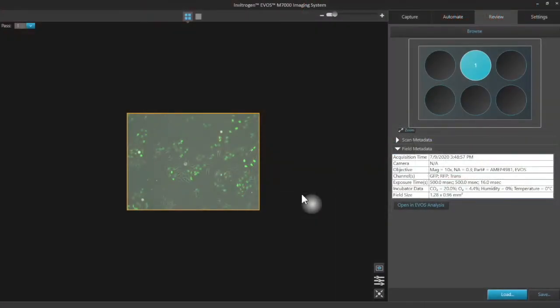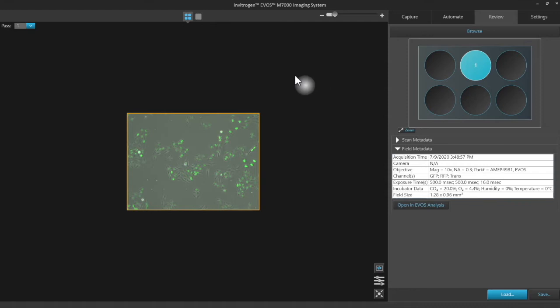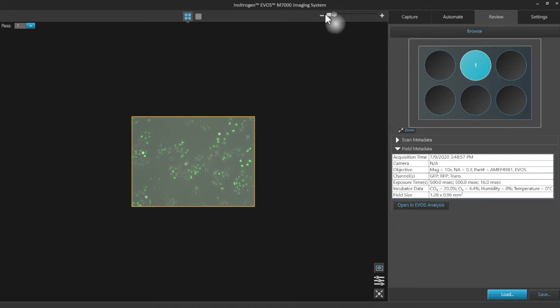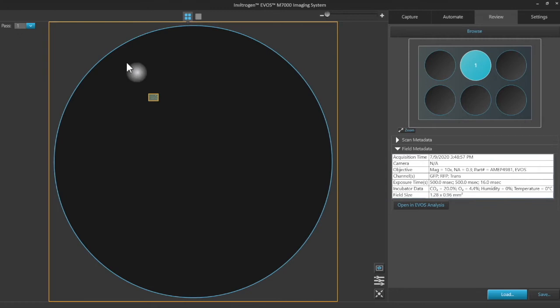We've finished scanning images of our cells in multiple channels. These data came from this well in the six-well microtiter plate, well A2, and they are in this location in that well.